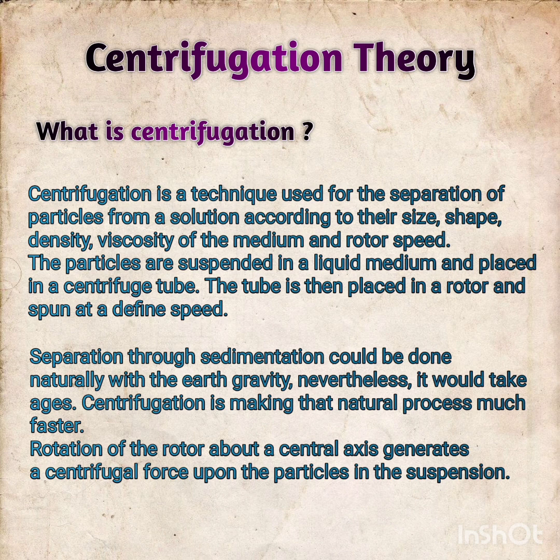All the work is done by centrifugal force, which is generated by the rotation of the rotor, causing the particles in the suspension to separate from one another.